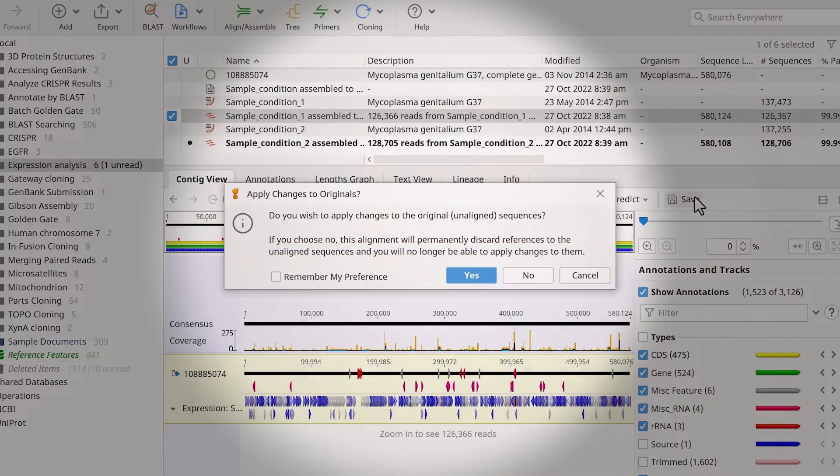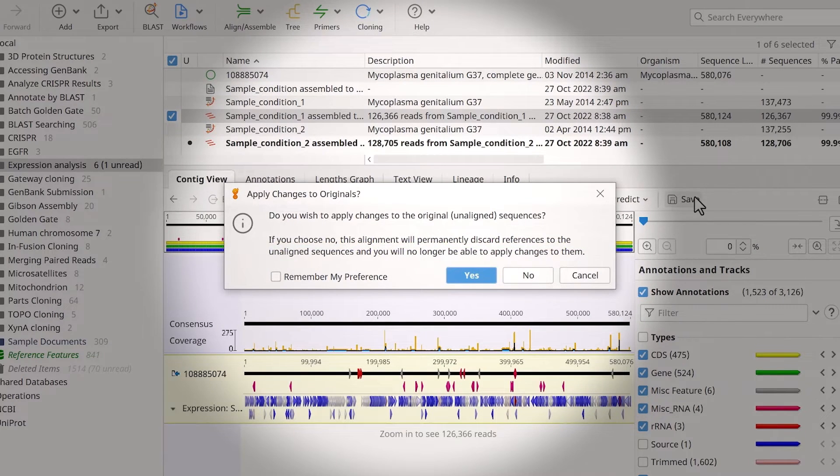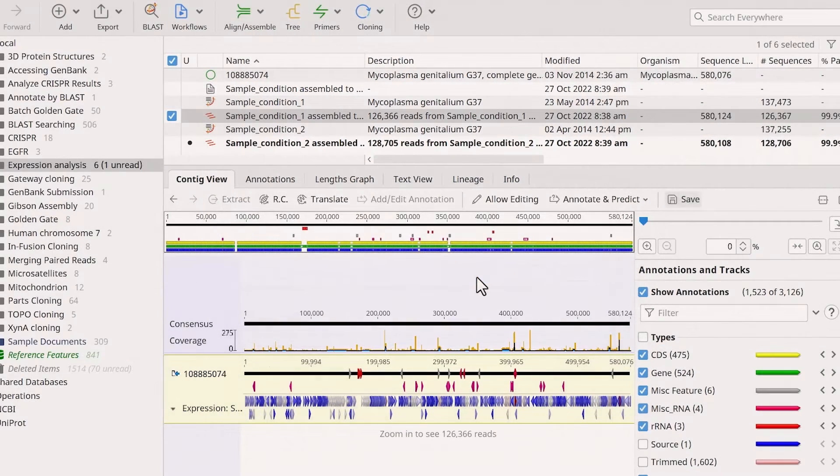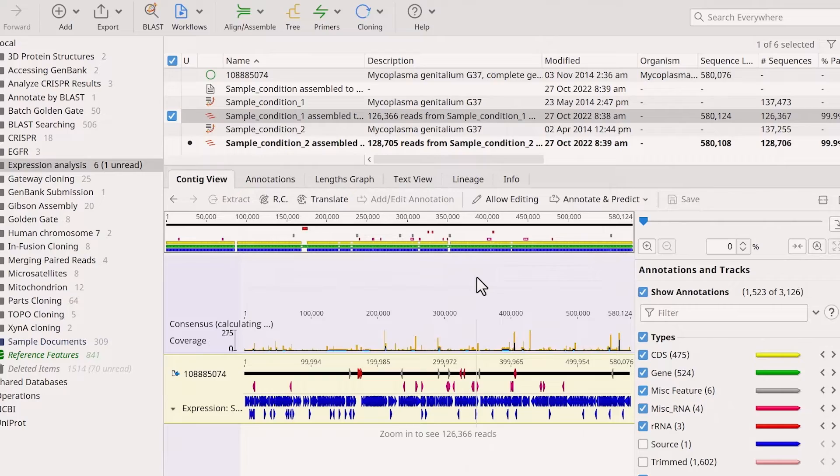Click Save to save your changes, and when prompted, choose to apply the changes to the original sequence.